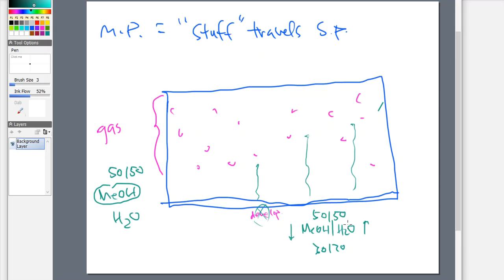That's because the gas phase has been created, and that gas phase has made an impact on how this plate is getting ready to separate. Because you thought you were making 50-50, but by the time the sample sees it, it could be totally different. You don't know that. So those are the things that you got to keep in mind.